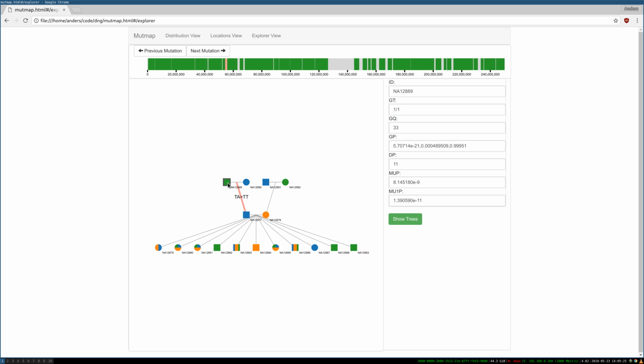If we look at a couple examples here, this node here is 0/0, so it's the reference in both cases for both bases, and then this one is 1/1, which means it's the alternative allele in both cases. And then this one is saying that it's 0/1. Now, this node is interesting in another way, because a better example of the 0/1 is this one here, because it's just completely orange. It's pretty much guaranteed to be 0/1, the reference and alternative.